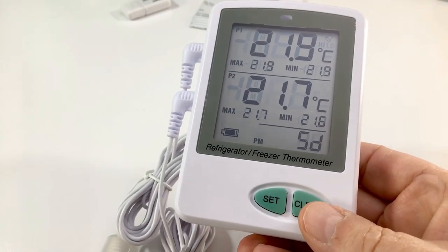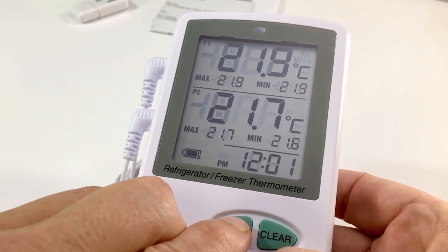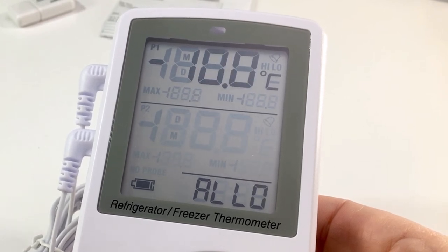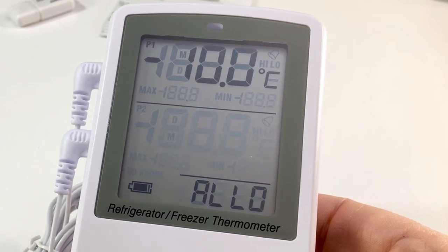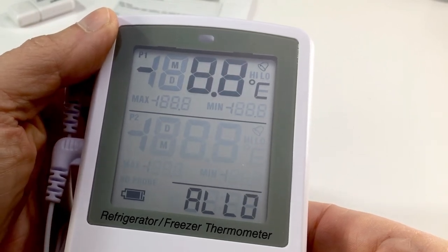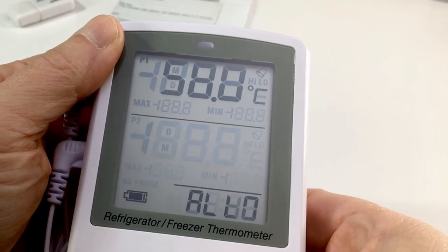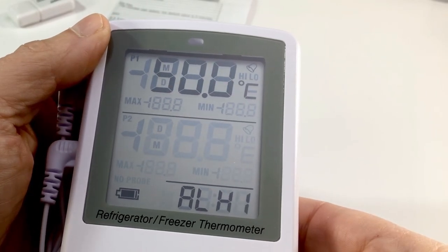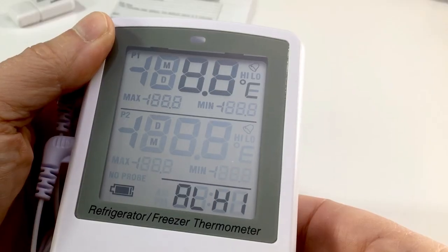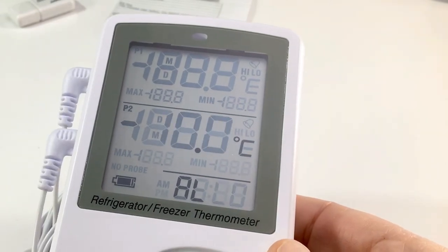To go into settings for min/max, press and hold the Set button until something similar to C shows in the time area, then release. You can see we have minus 10 degrees for a low on P1. I want to monitor a refrigerator using the CDC recommendation of 2 to 8 degrees, so let's set the low to 2 degrees. Scroll up to 2 degrees and press Set. Now set the high to 8 degrees Celsius — scroll to 8, press Set to confirm that selection.